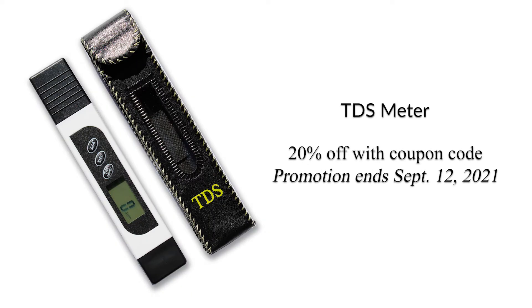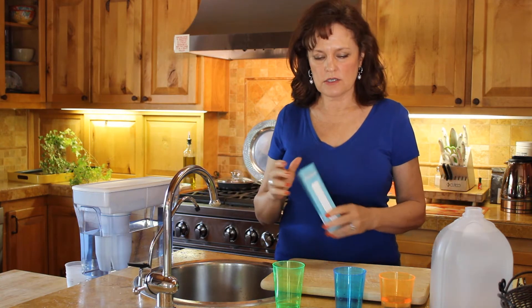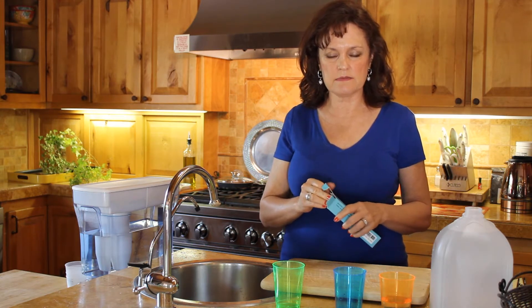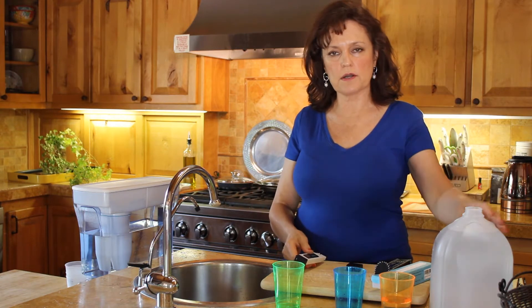Total dissolved solids are chemicals, metals, and other compound pollutants that can be found in your tap water. Today I'm going to show you how to use the TDS meter so you can find out an acceptability range for the different types of water.